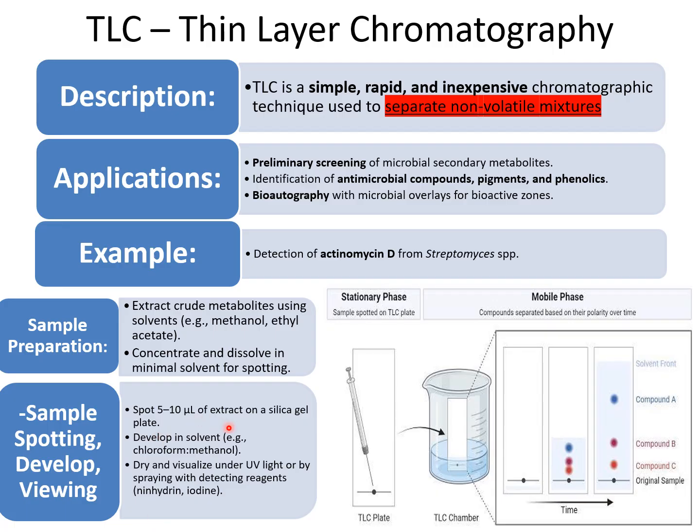In this case, a spot of 5 to 10 microliters of the extract is made on the TLC plate and subsequently developed in a TLC chamber containing the mobile phase. During the development, the mobile phase moves along the stationary phase together with the analyte through the process of capillary action.